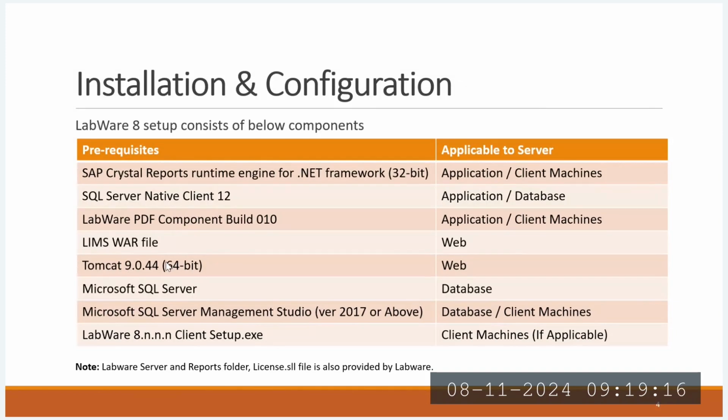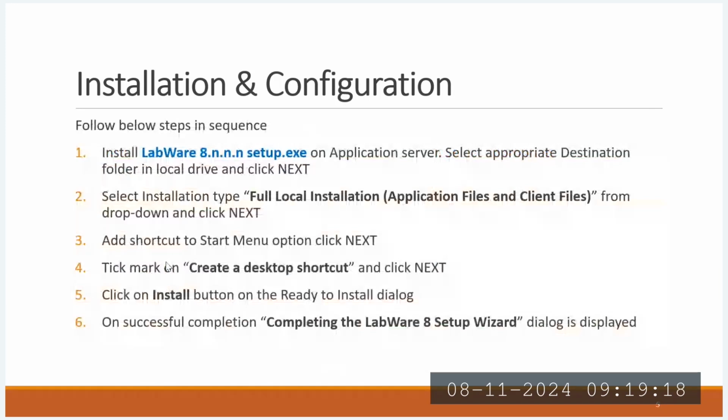While performing installations, there are procedures for how to start the installation and where I have to install. After installation, how to make a desktop shortcut on our laptops or local systems. We are going to discuss all of that information thoroughly.